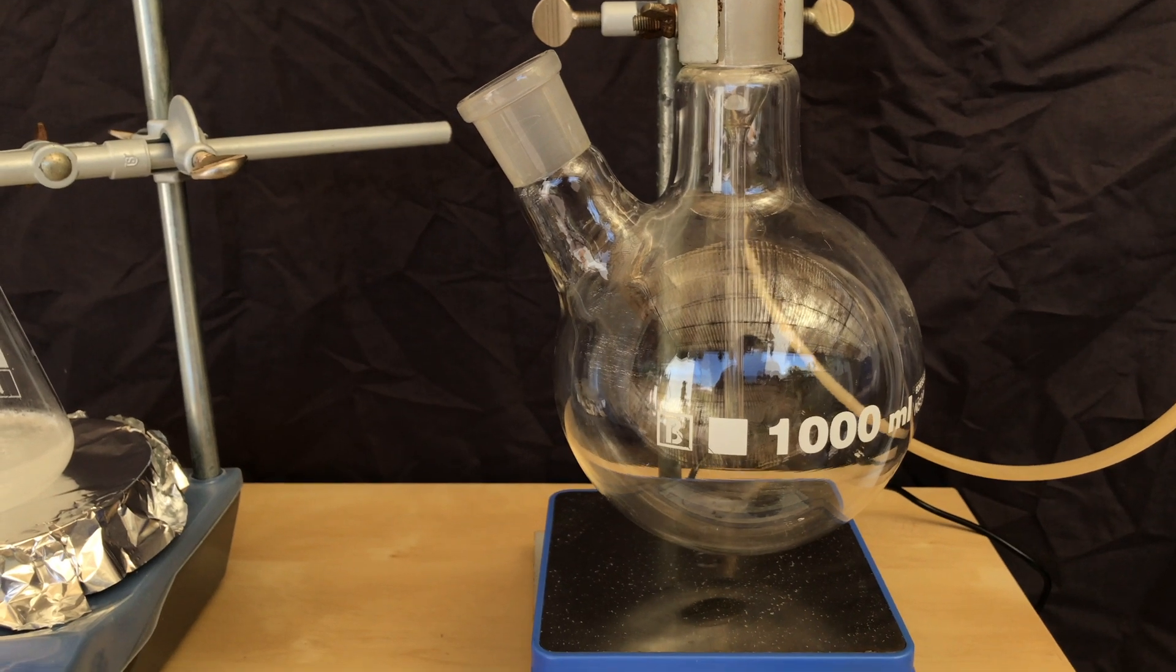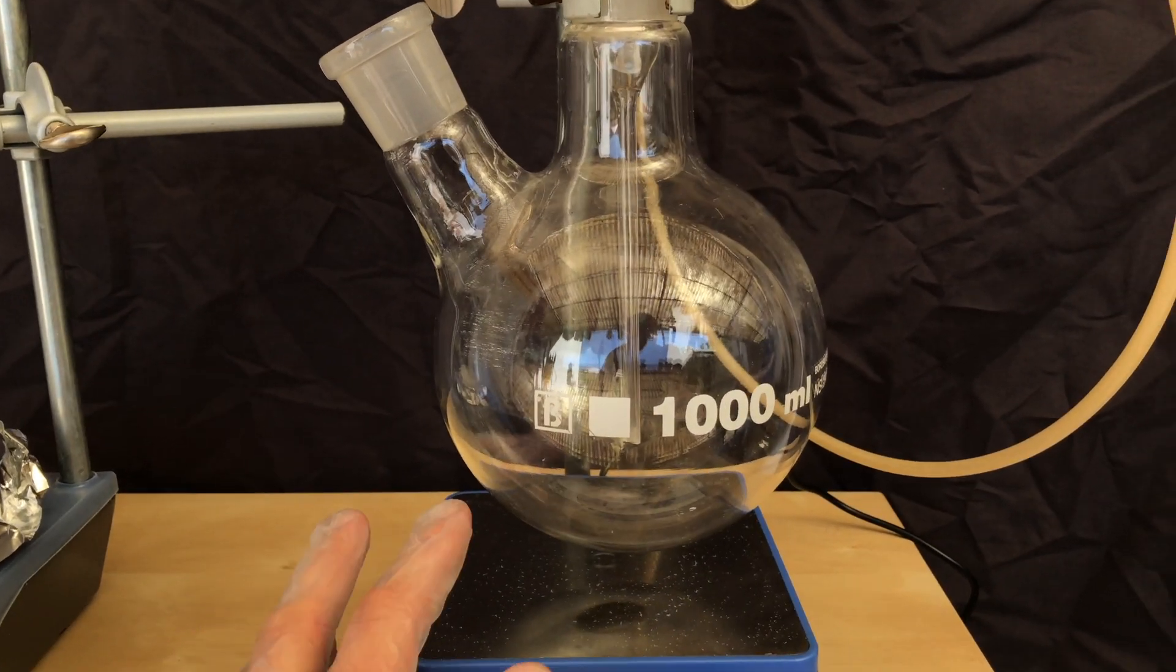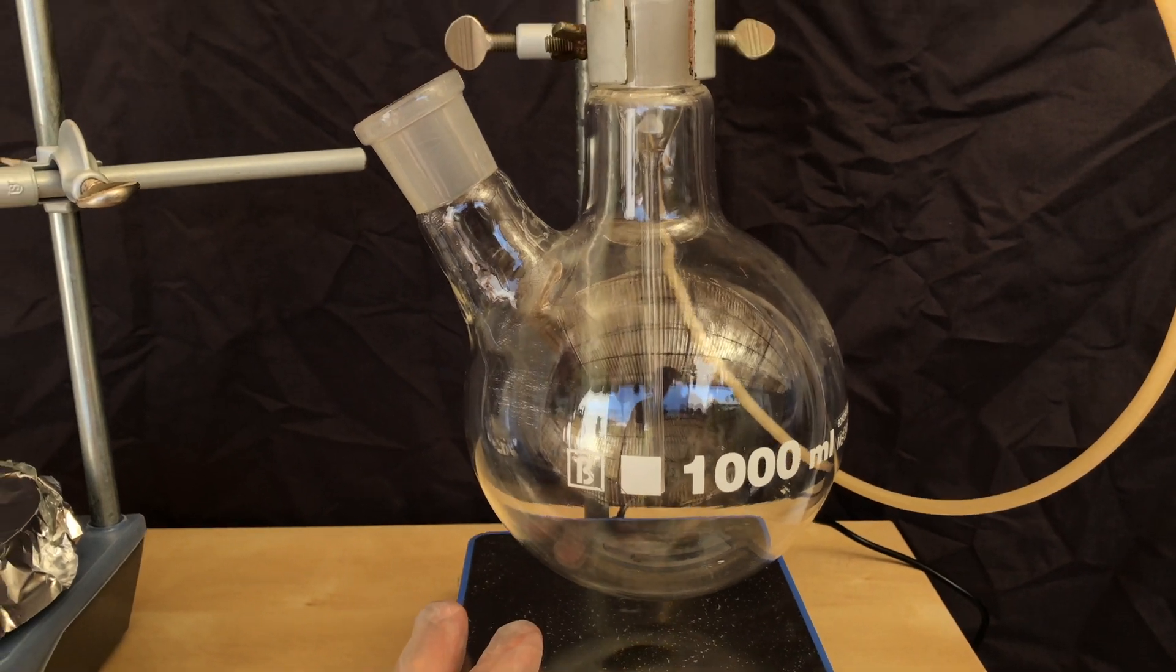This is the second part of our apparatus. We have this simple flask on a magnetic stirrer and the flask will later be submerged in an ice bath.